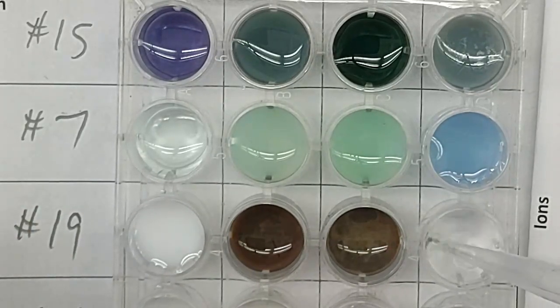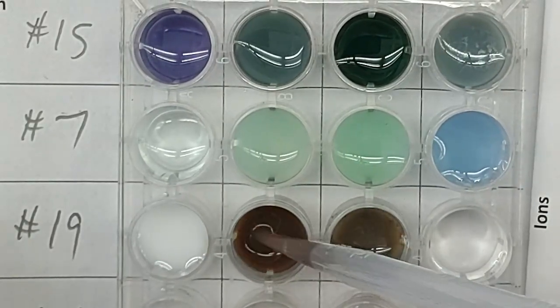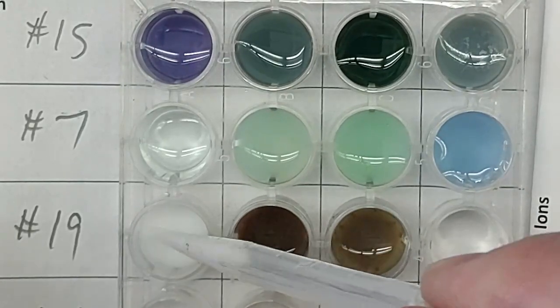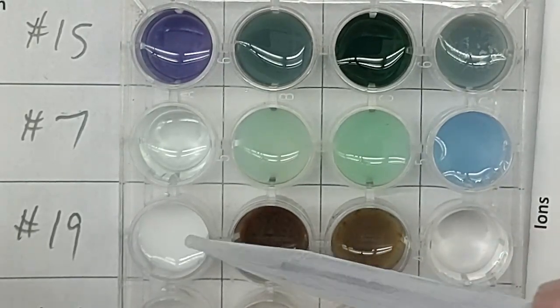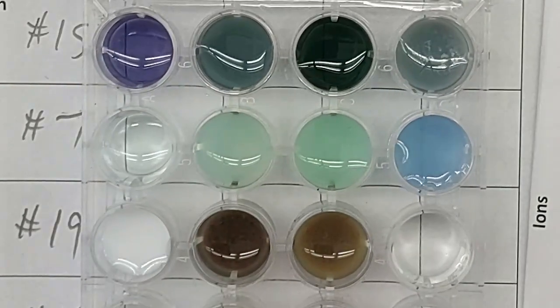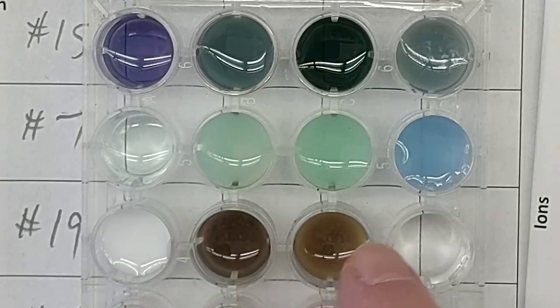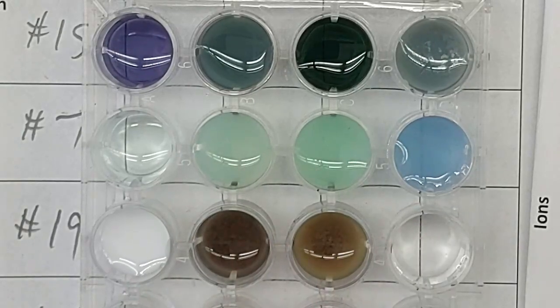Give them a mix. Okay, move it over so you can see whether you can see through them. Definitely can't see through it. Can't see through it. Can't see through it. Can see through it. Number 19.